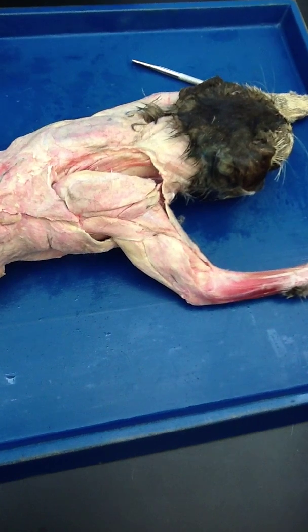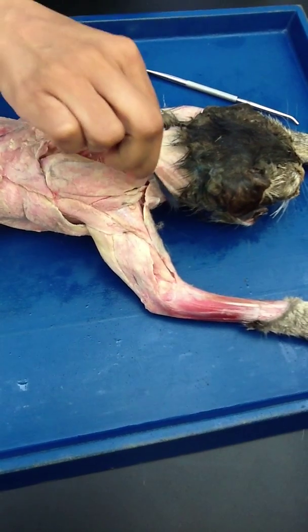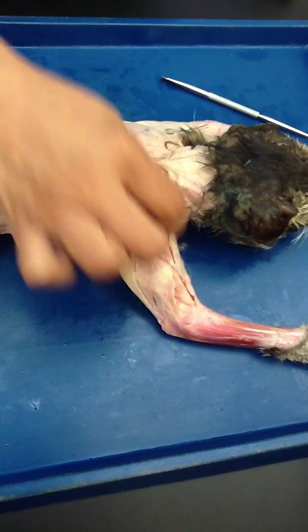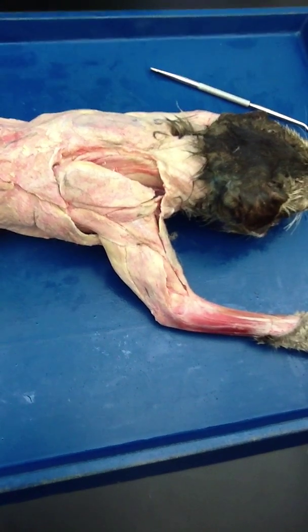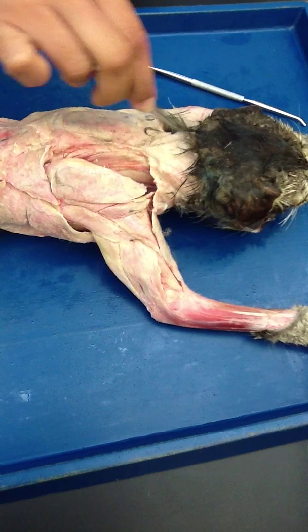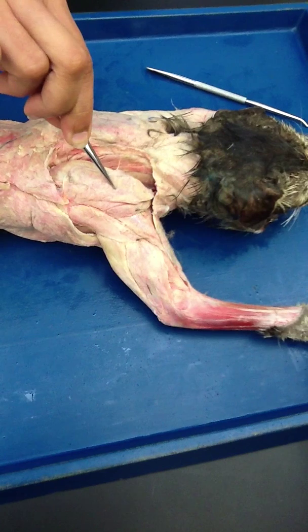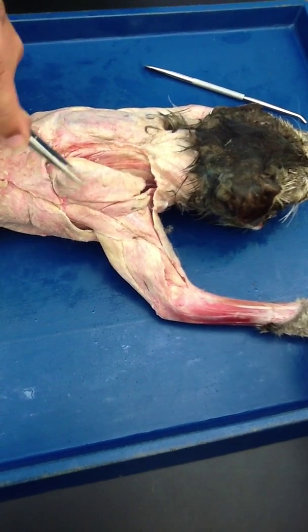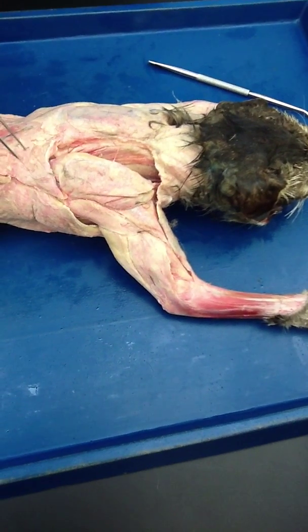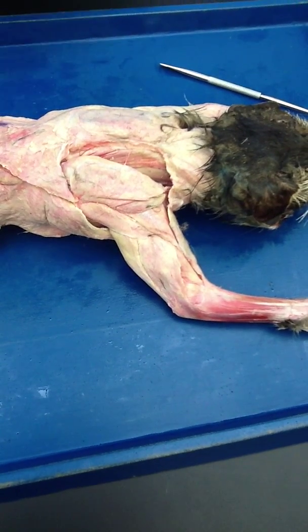First we are going to do the trapezius. You see this muscle right here, which was like a collar and it turned in front a little bit? That was clavotrapezius. This is acromiotrapezius because it is attaching to the acromion process, and this is spinotrapezius because it is attaching to the spine.